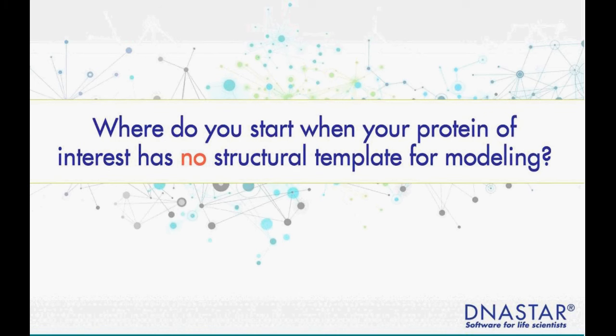This is a critical question when working with a protein of unknown structure, as most protein biochemists, molecular biologists or geneticists often require access to an accurate structural model that can help guide any mutagenesis or engineering work to help resolve questions related to structure function.